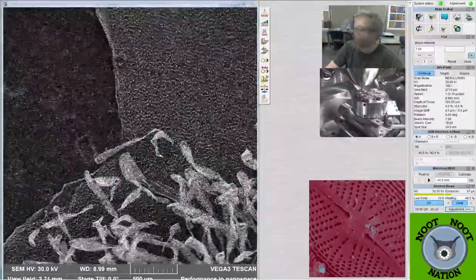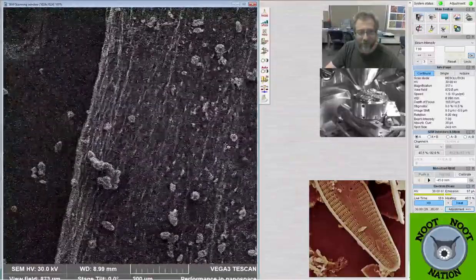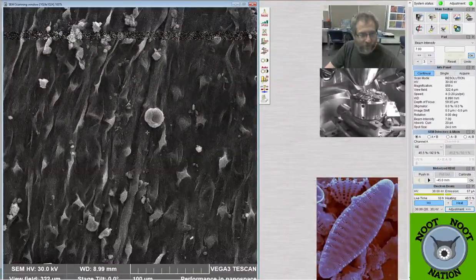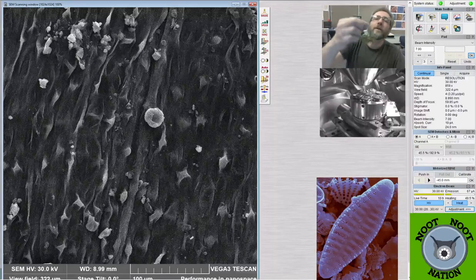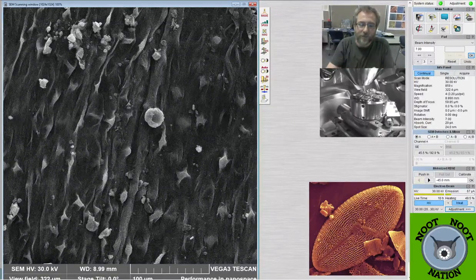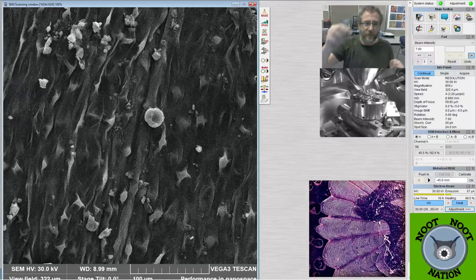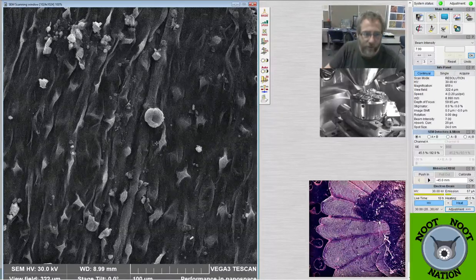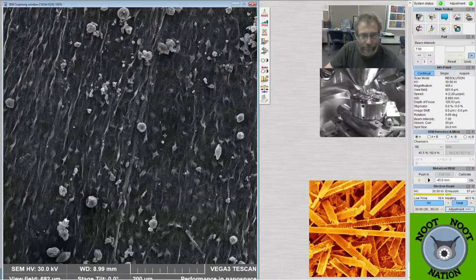So next up is maple pollen. This might actually be something that's getting you right now if you're allergic to pollen. Maple is out pretty heavily where I live, and you may not recognize it. The fronds of tree pollen for maple look like this. Those little helicopter things are the seeds that develop, and the flowers are these little things. Sometimes you'll see birds eat them because they're trying to get at the pollen. I opened up the flower part. I didn't put any of the little helicopter pieces on there, but I wanted to get some other tree pollen.